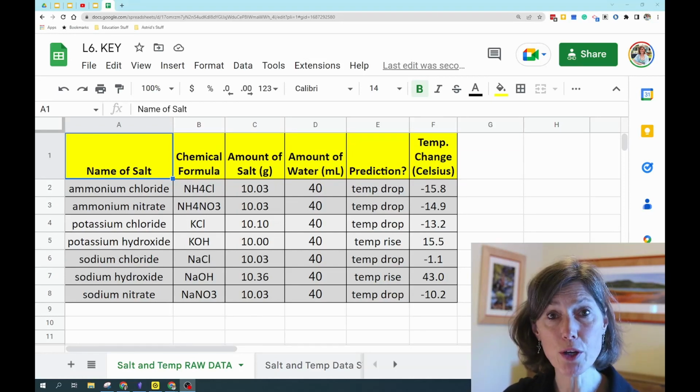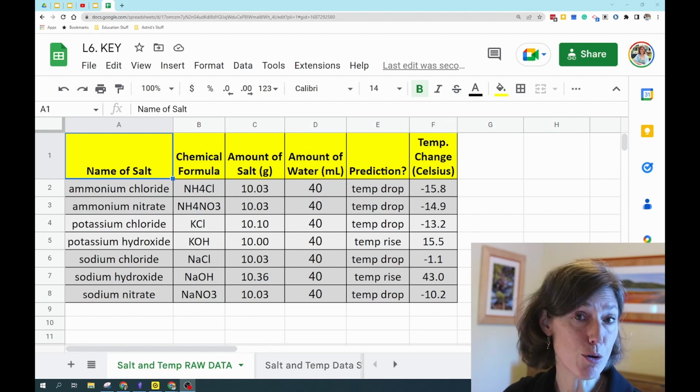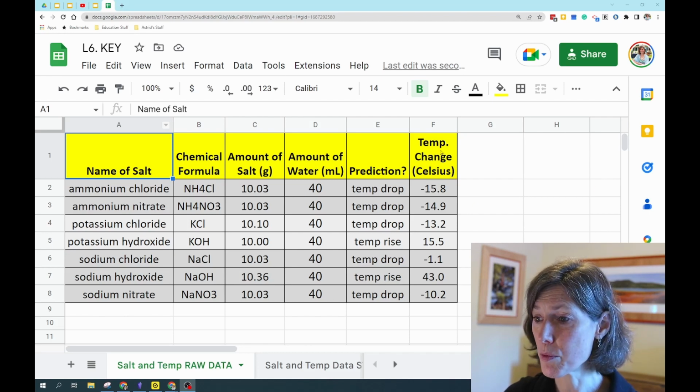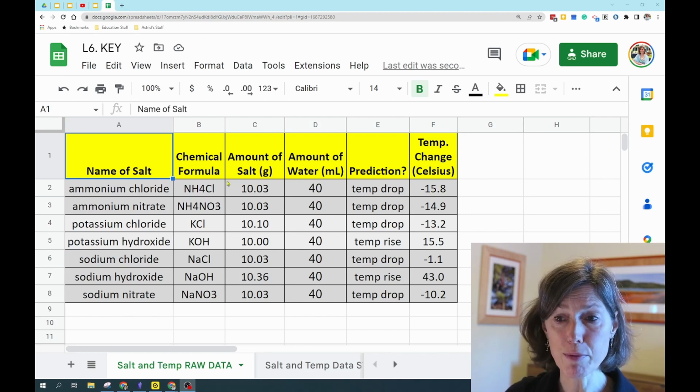So what I'm showing you here is the Google Sheets where we have all this data collected. And the data is kind of all over the place. We're seeing the 7 different salts, and we're seeing all kinds of temperature changes, either a drop or a rise. And so the first step that I'm going to do is have students sort this data.